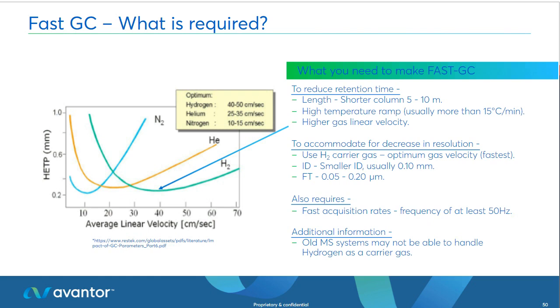It's good to check that the GC is suitable for this. Additional information, old MS systems may not be able to handle hydrogen as a carrier gas, so it's good to just double check this.